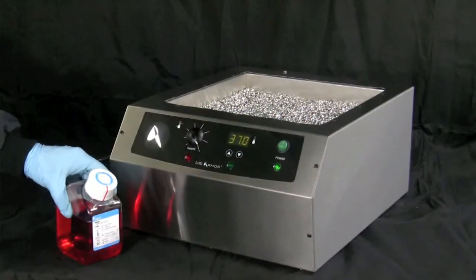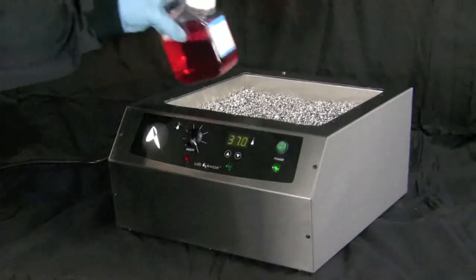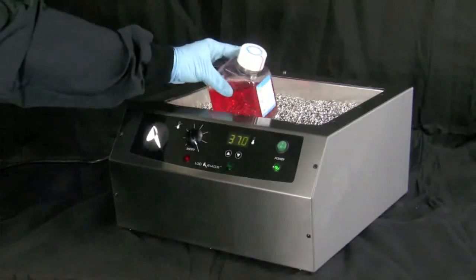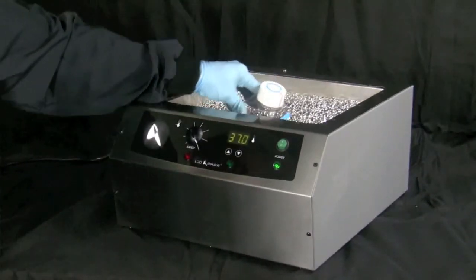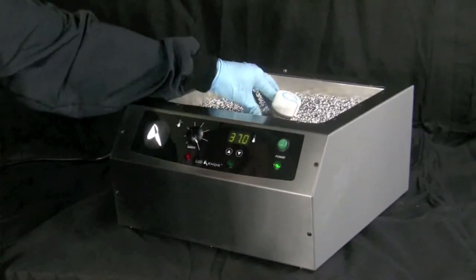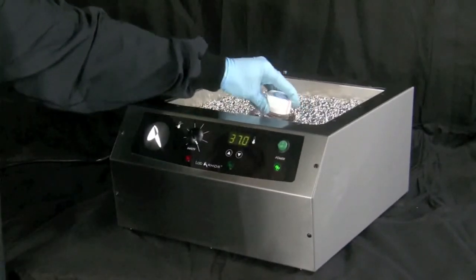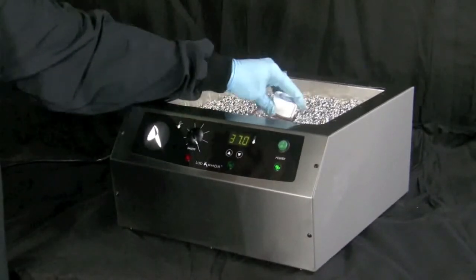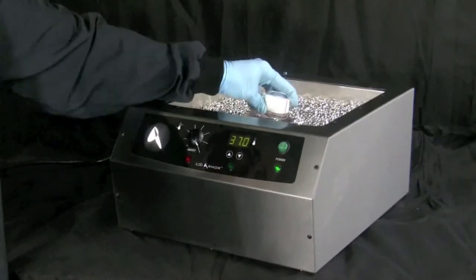For thawing, bring frozen vessels to 4 degrees centigrade in a refrigerator or just prior to immediate use, bring the sample to room temperature on the bench top before placing in beads to reduce incubation times.